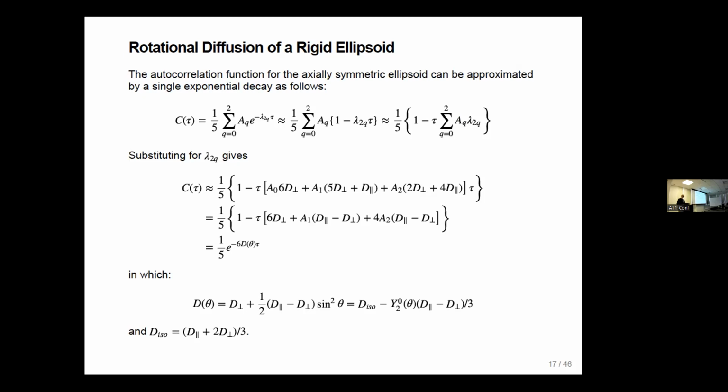That's been used to get constraints to structure determination, getting orientation. So Nico Chandra has done some of that. As it turns out, if you can align your protein and measure residual dipole couplings, those turn out to be easier. So cases where you can get alignment, people would prefer to do residual dipole couplings. The math, as you can see, is going to be almost identical.